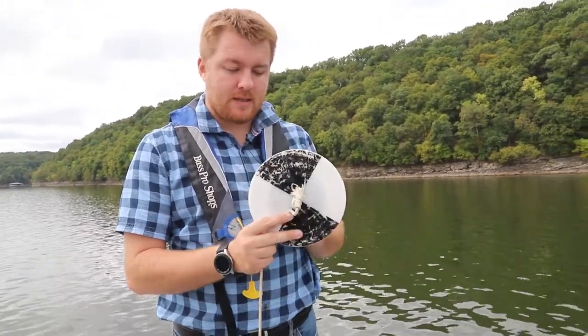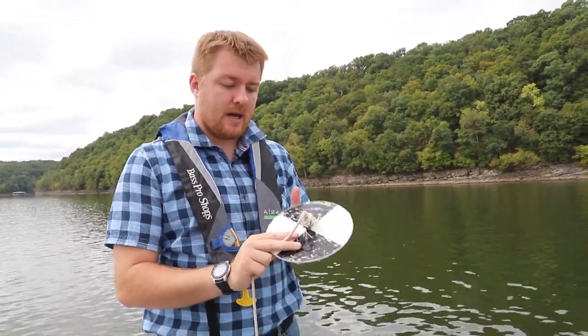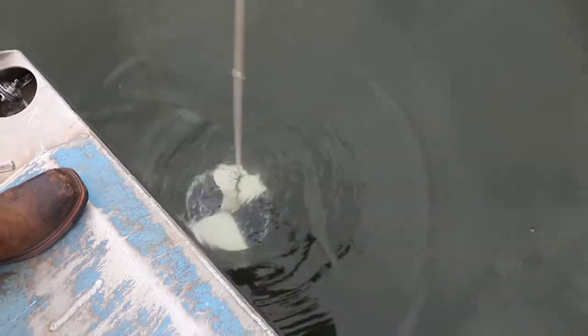What's really nice about the Secchi disk is that it's so simple you can use it in any type of aquatic system. Anyone can use it. It's not crazily expensive like a lot of our equipment. How it works is you drop it in the water, and with the black and white triangles on that circle, it gives you enough contrast so you can track it as it moves down.